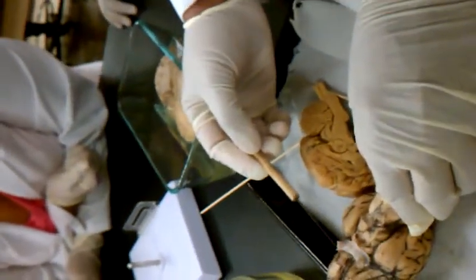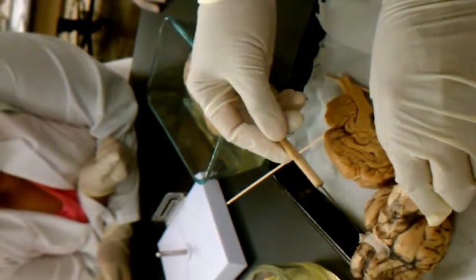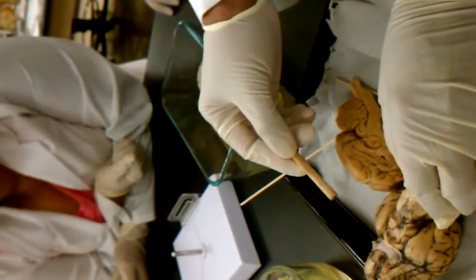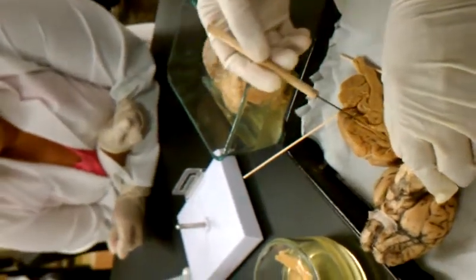So the optic nerves make the crossover of the optic chiasma. This is your optic tract, like olfactory tract, optic tract, path of the nerve. But in the middle is the optic chiasma. Okay.